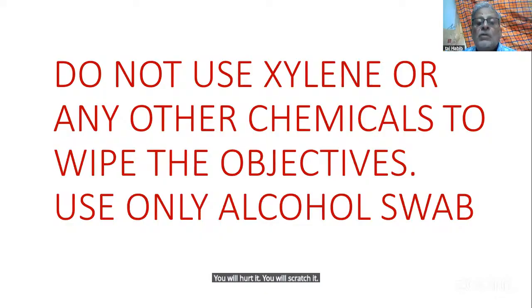So what is the solution? An old handkerchief, gauze, but not toilet roll, please.